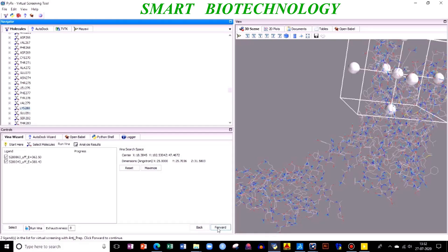After this, directly go and click on forward. Before that, what is exhaustiveness? Exhaustiveness is nothing but my system has eight CPUs, so it will work on eight CPUs so it will be faster. Don't change anything. Click on Run Vina, then just click on forward.